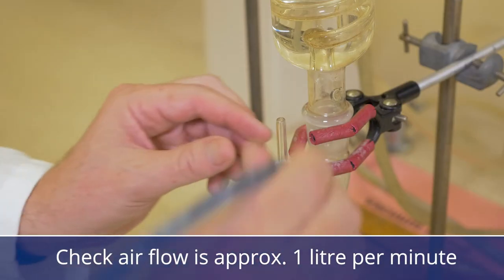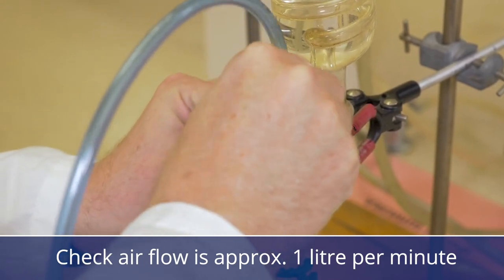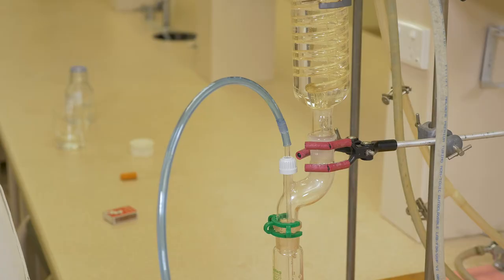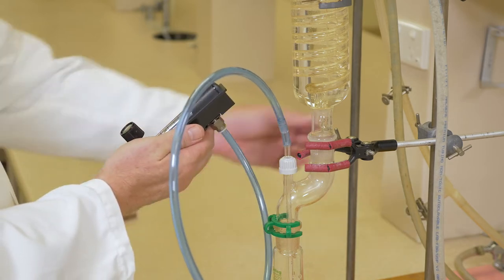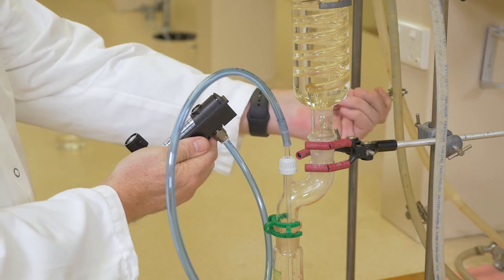Before doing the test, it is important to check that the airflow is approximately 1 litre per minute. This can be most easily done with a flow gauge, as seen here. An incorrect flow rate can result in incorrect results.